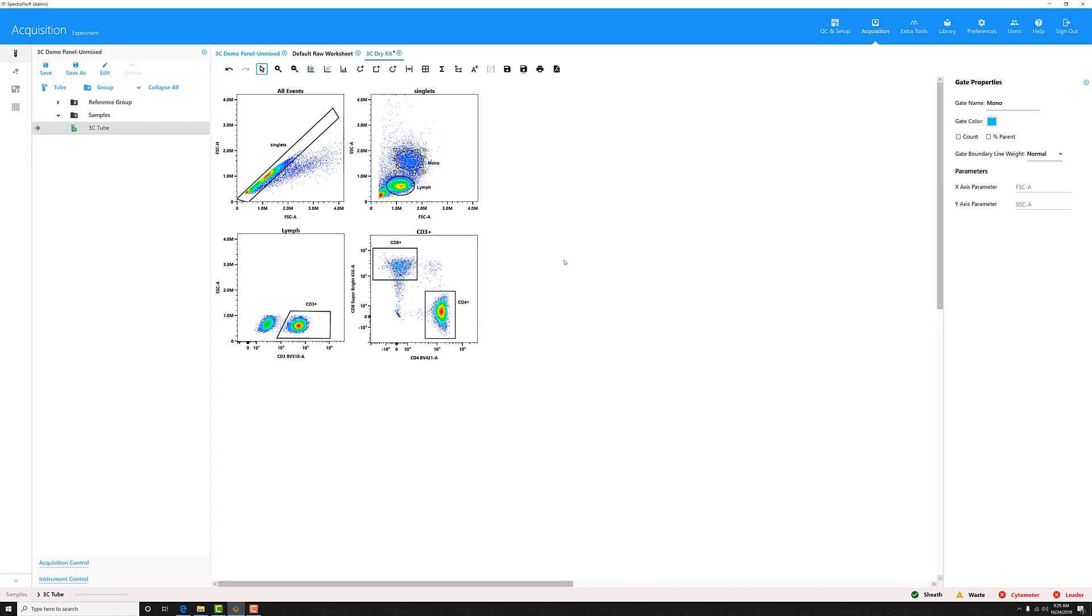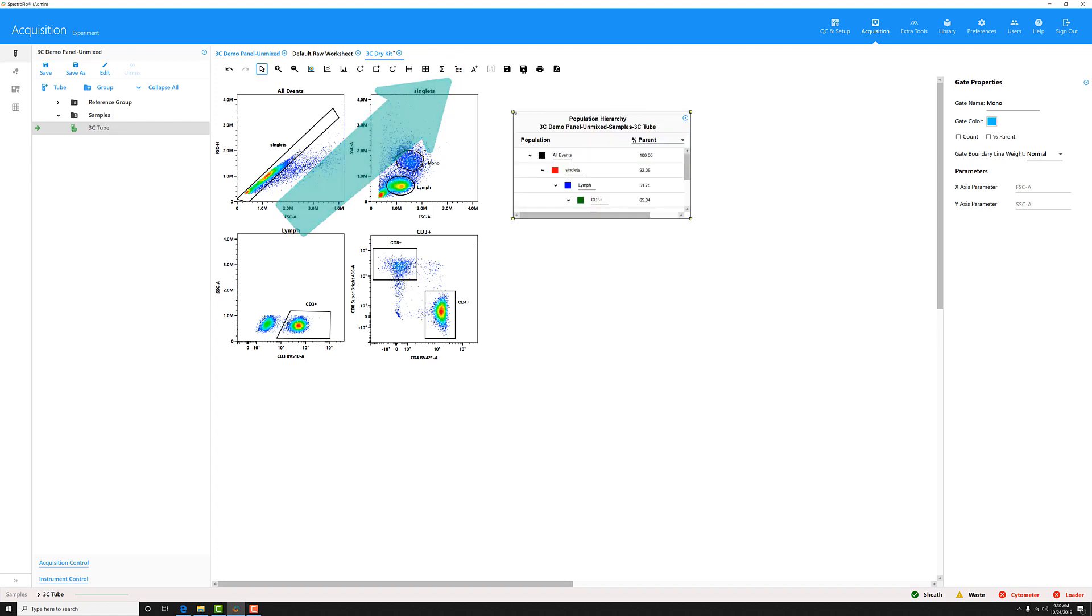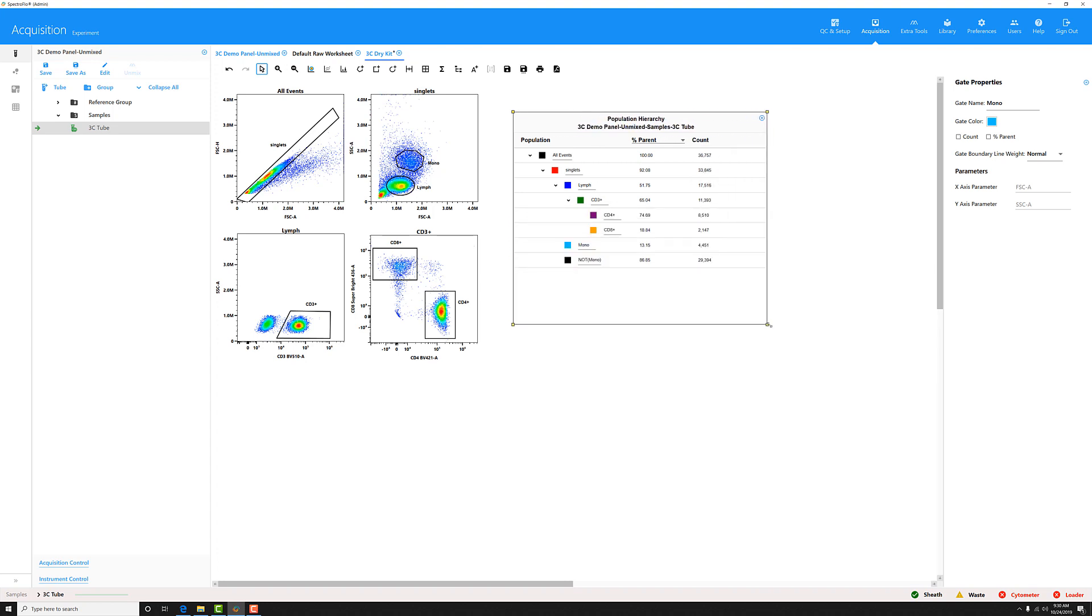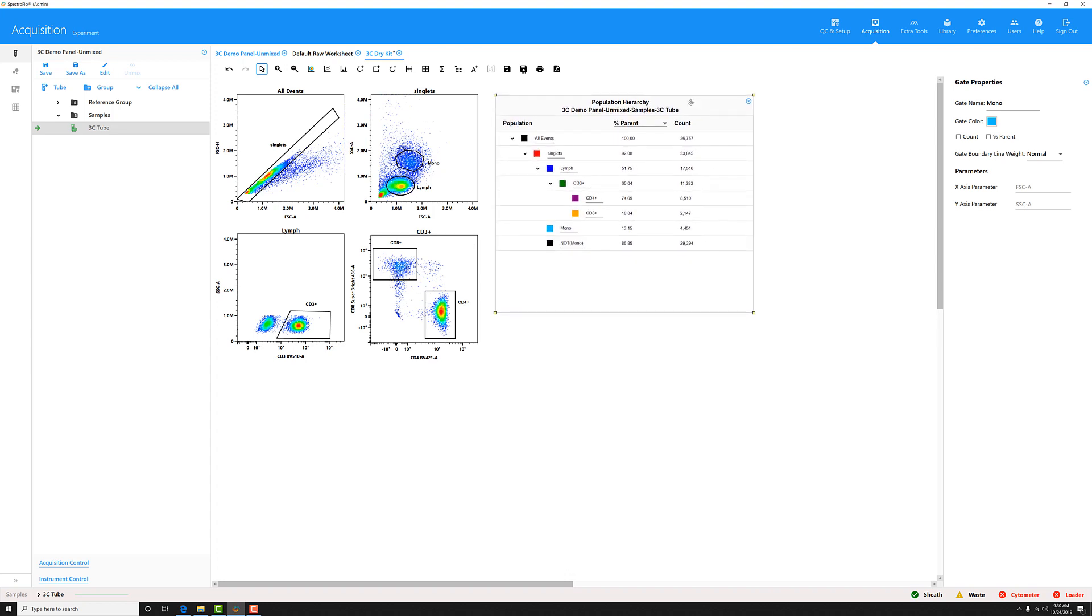For the other two gates, the AND and the OR gate, you have to create these off of the population hierarchy. So let's go ahead and click the population hierarchy button, and then click in the worksheet to create a population hierarchy. I'm going to make it a little bigger so I can see what I'm doing.